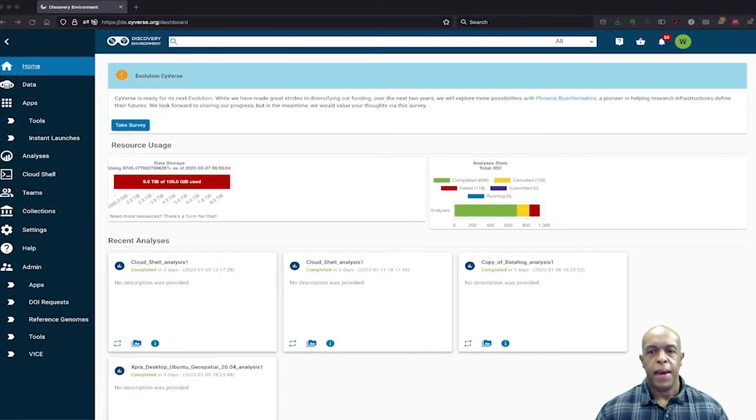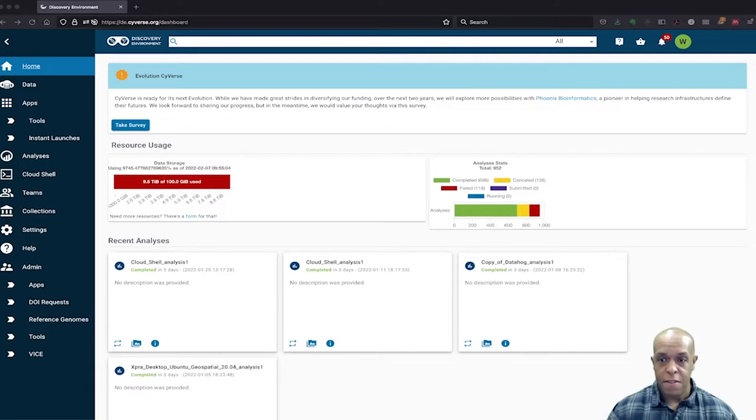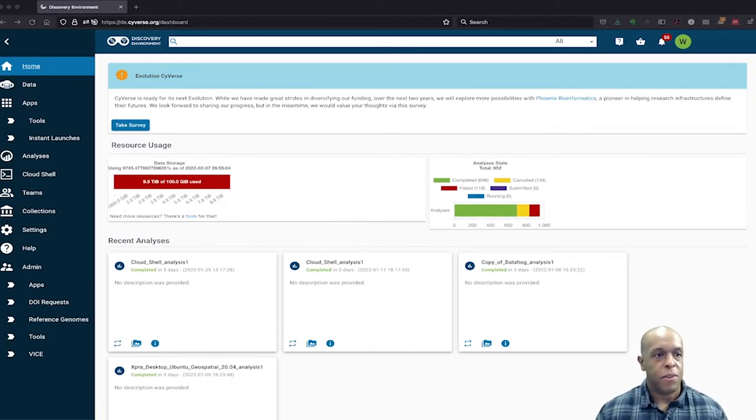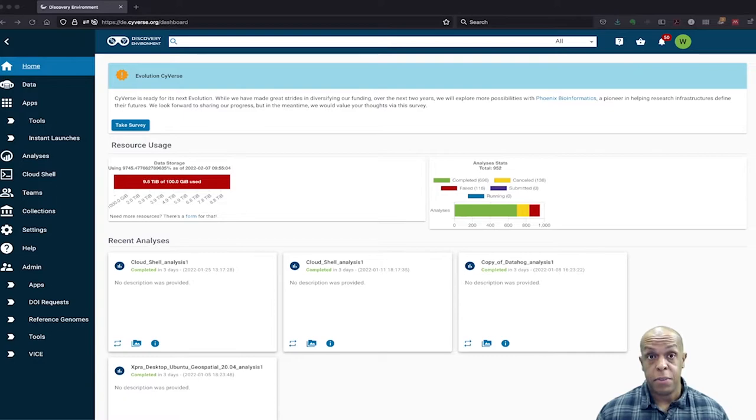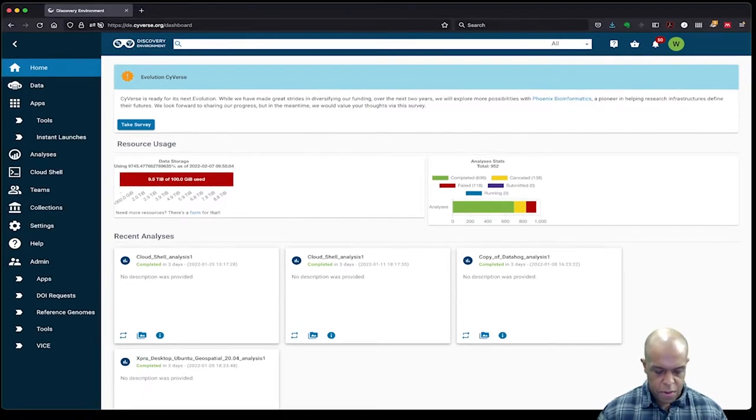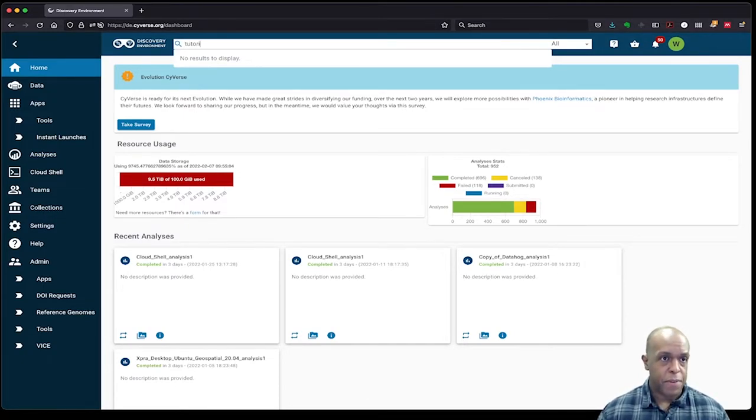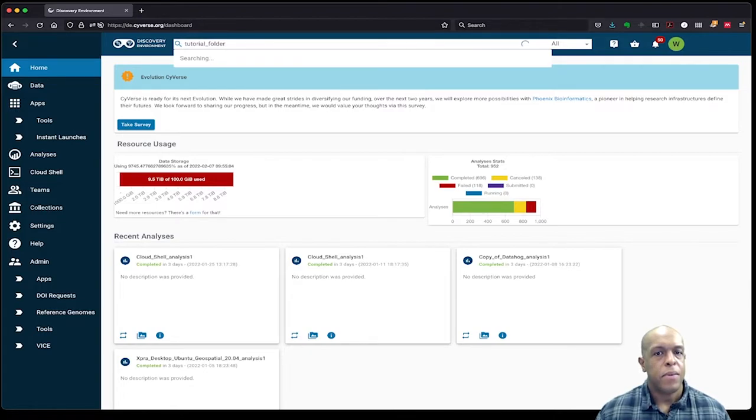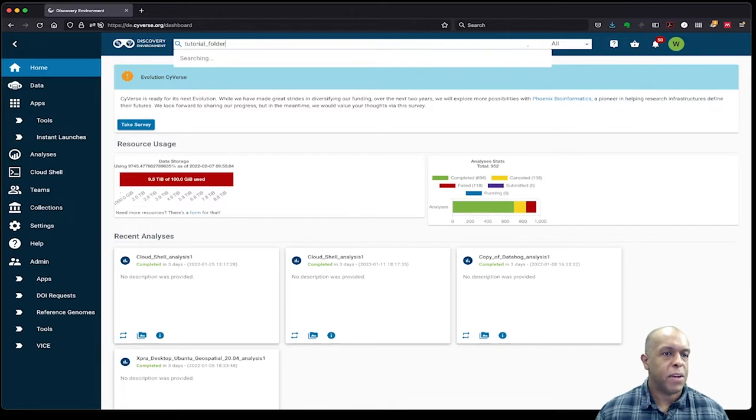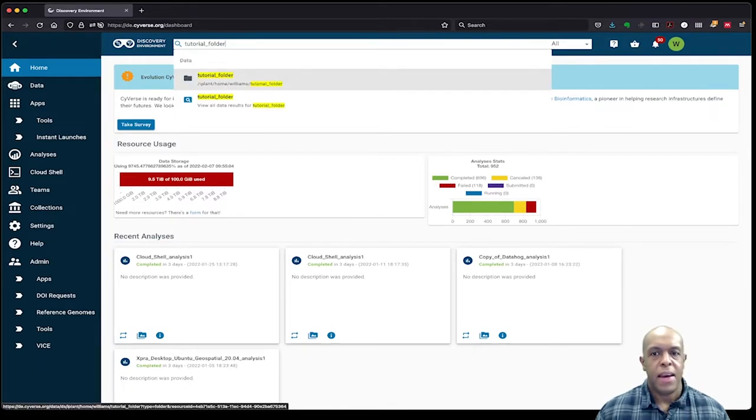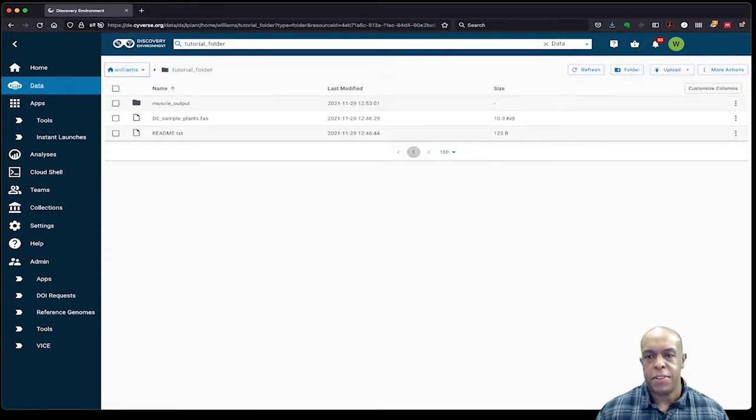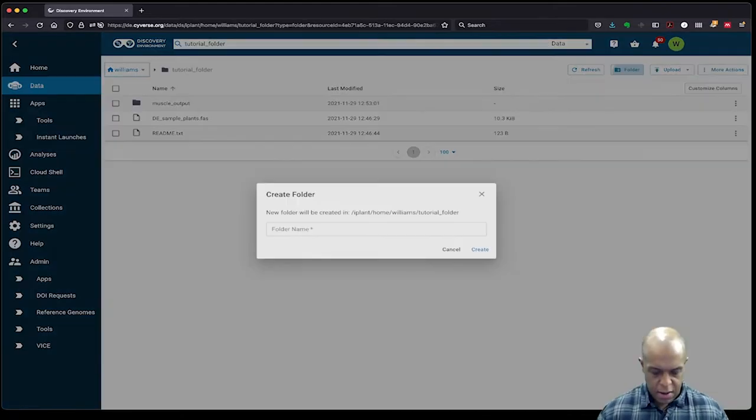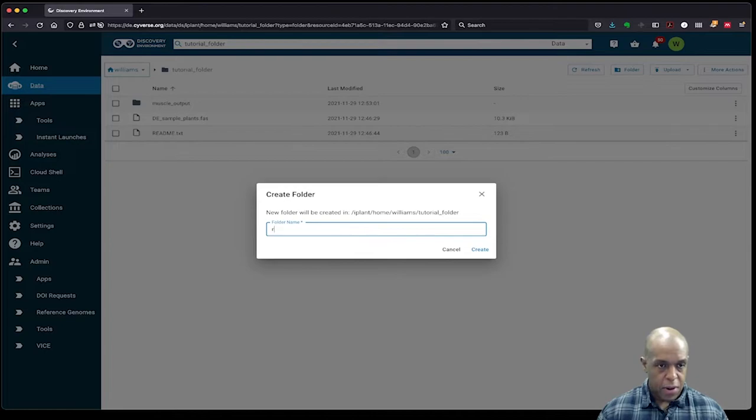Okay, so I am already logged into the CyVerse Discovery Environment. The first thing that I am told to do in the instructions is create a folder where I'm going to save my output. So let me go ahead and search for the tutorial folder that I have previously created. And I see this is the one that I'm looking for. And the instructions say that I should create a folder called rocker_output. So I'm going to go ahead and add a new folder and call it rocker_output.